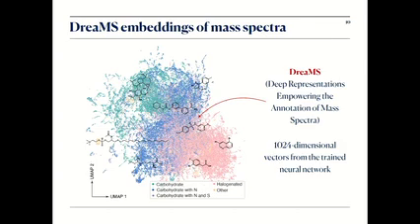You can see here easily that even though the model was trained just on raw mass spectra, by the colors it separates well all the spectra by the structural properties of corresponding molecules. For example, carbohydrates are well separated from halogenated molecules and so on. So this shows that, to some extent, the model understands the chemistry behind mass spectra.